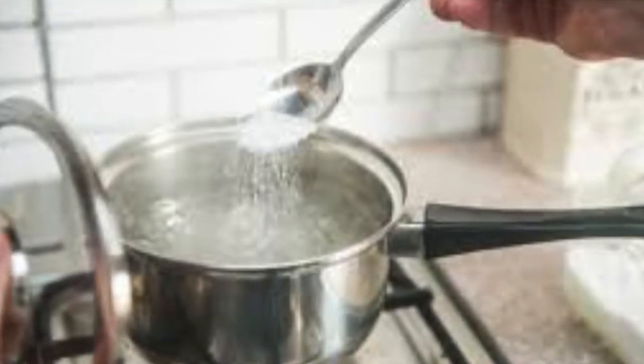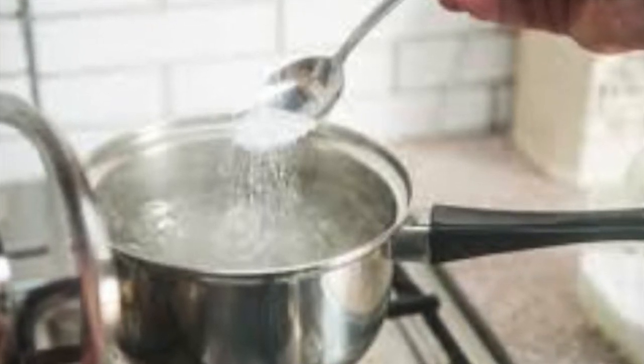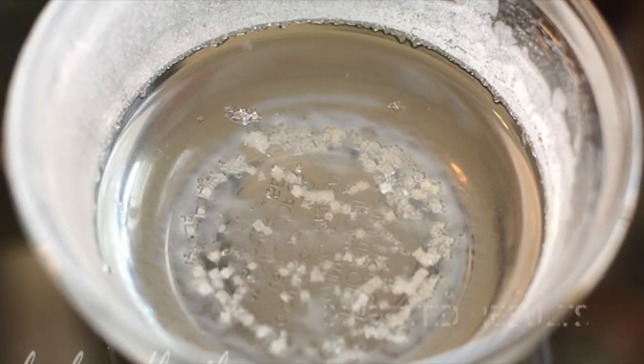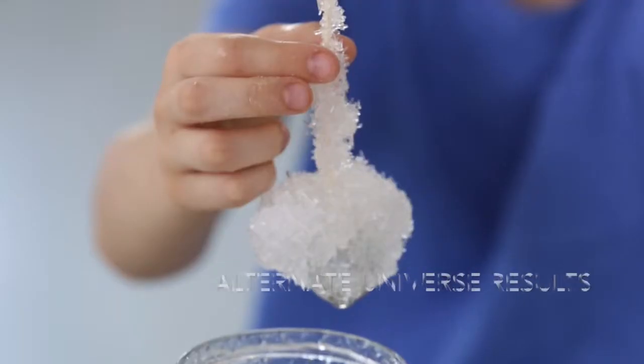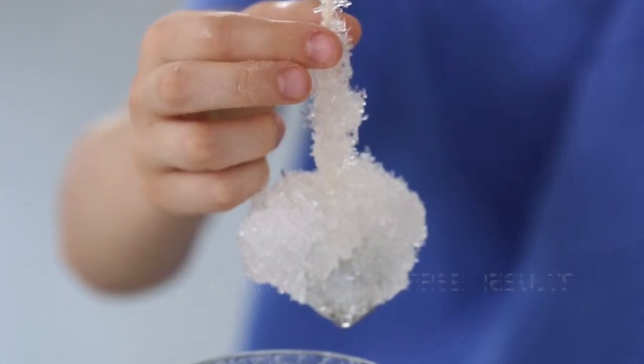After the NaCl completely dissolves, we would then place the solution in a container and allow the H2O to evaporate. As the water evaporates, the concentration of the solute, the NaCl, increases, and since NaCl is a solid at room temperature, its solubility permits it to precipitate from the saltwater solution and create crystals.